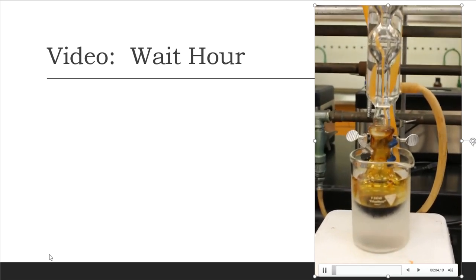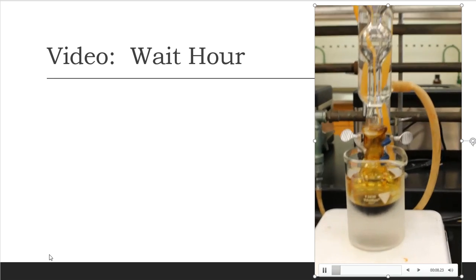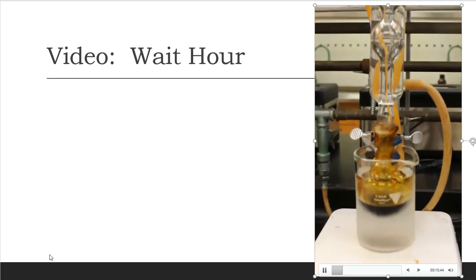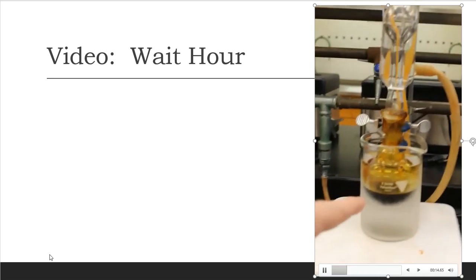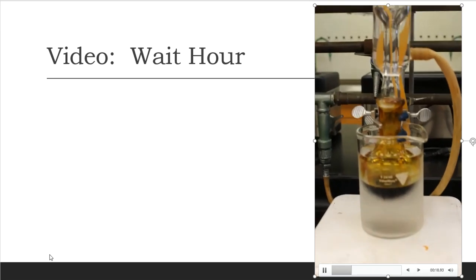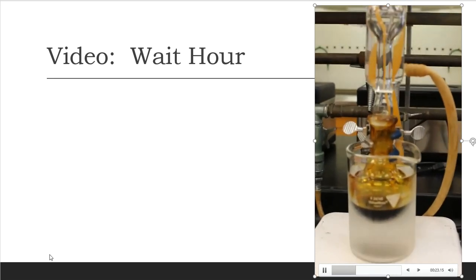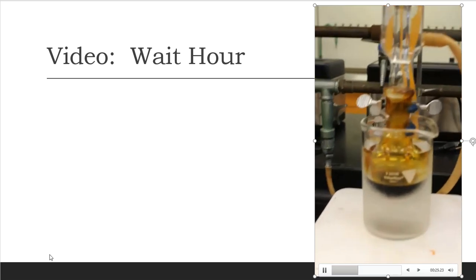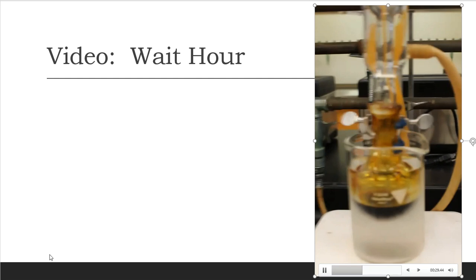Okay, so I'm at the part of the procedure now that really tells me to take the separatory funnel off, take the Claisen adapter off, and replace it with the reflux just directly, and that's what I've done. So I still have the ice bath, I still have the boiling flask that sits down below with my hexene, sodium borohydride, iodine, THF, all of that soup is in there mixing, and it's going to be ready for dinner in about an hour, so that's when we'll come back.